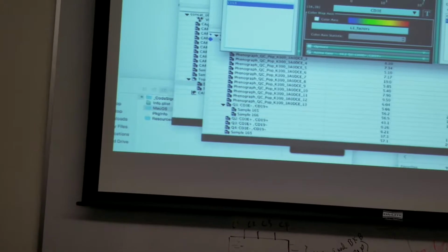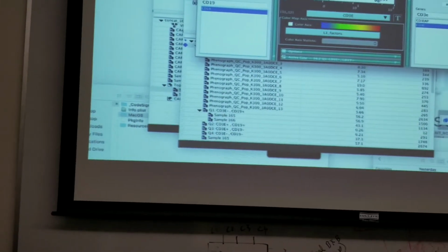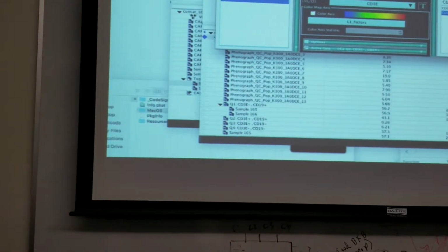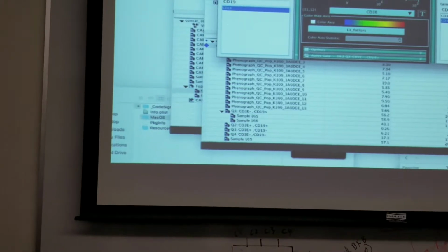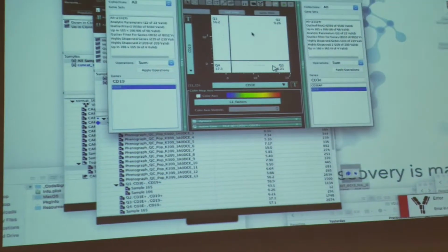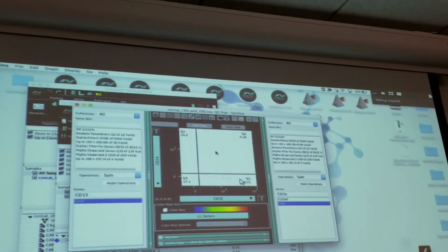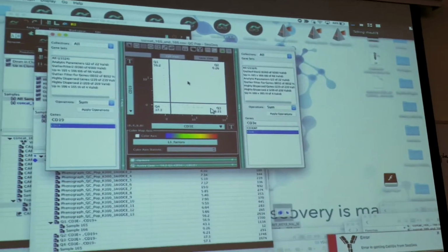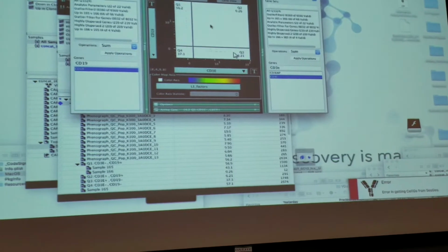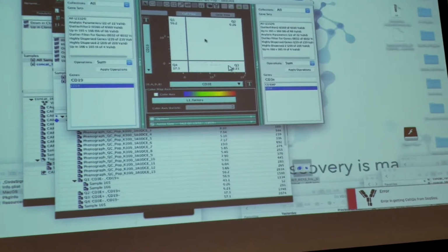Actually, the immunoglobulin, I don't know if this is right or not, because each immunoglobulin, if I tap on it and go to GenBank or something, it shows this thing, but it's not all there. I'm not sure whether you use the GenBank version or the version we get. If you tap any of those V regions and you search GenBank, it finds it, but it's not exactly the same.